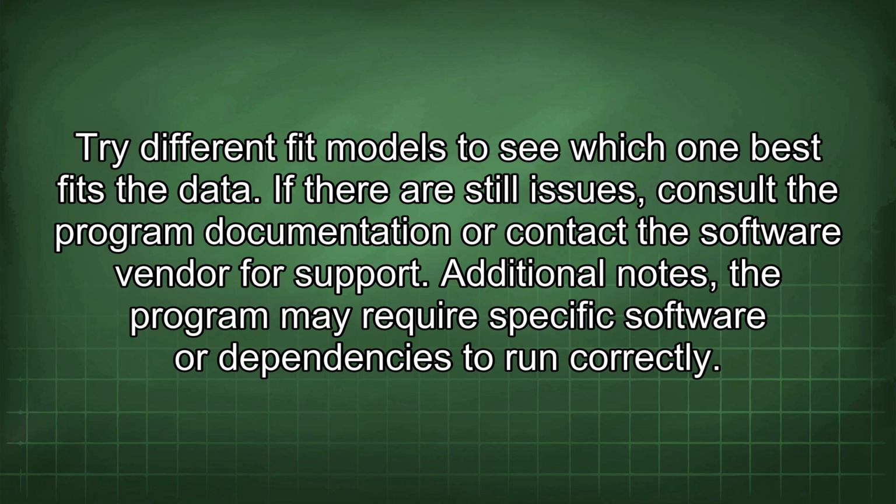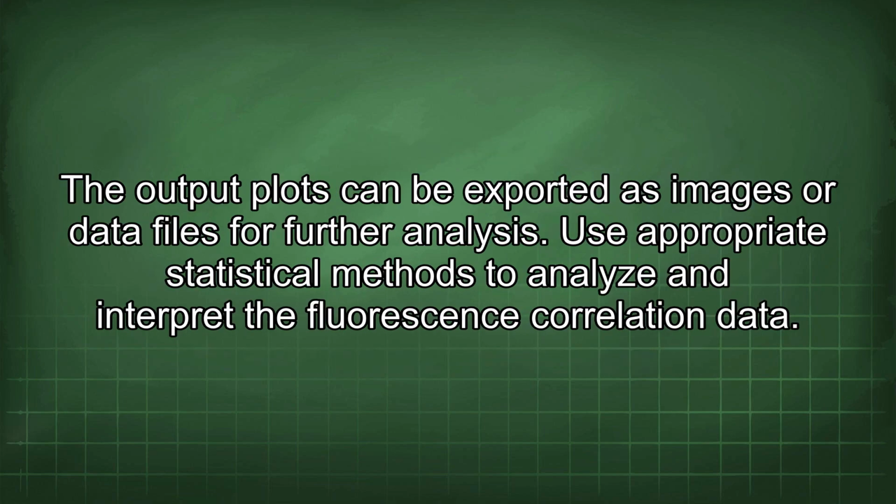Additional notes: the program may require specific software or dependencies to run correctly. The output plots can be exported as images or data files for further analysis. Use appropriate statistical methods to analyze and interpret the fluorescence correlation data.